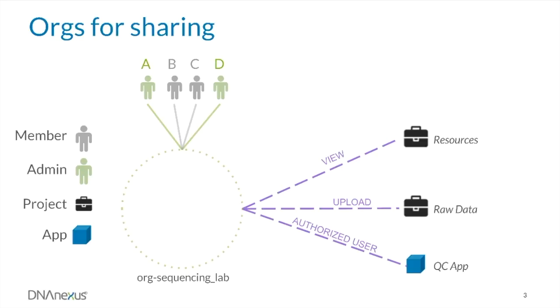Orgs also make it easy for org admins to revoke user permissions to shared data and apps. Say user C leaves the lab and should no longer have access to lab projects and apps — the org admin can simply remove her from the org. Now only users A, B, and D have access to the two shared projects and the shared app. User C has been removed from all projects and apps shared with the org.